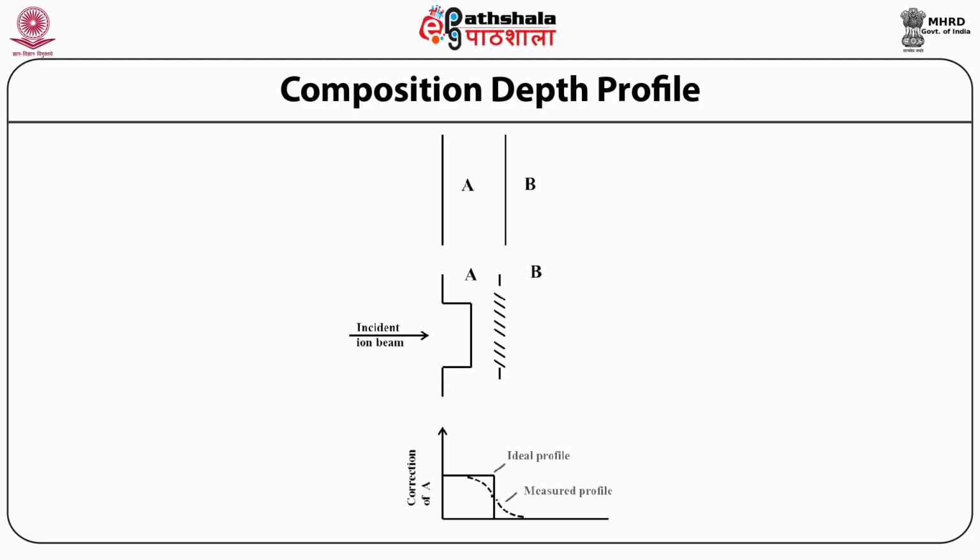In samples comprising several elements that are not uniformly distributed, certain areas would be etched faster than others depending on the preferential etching. This results in a rough crater surface, and increasing depth of etching could produce much greater structure.